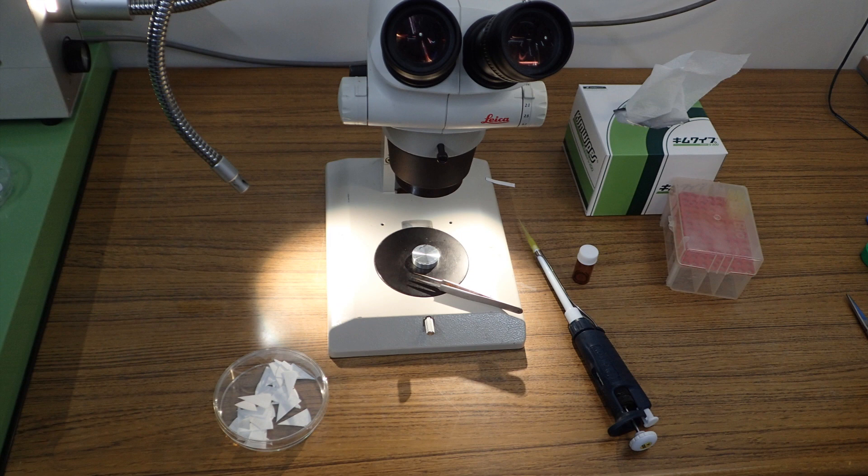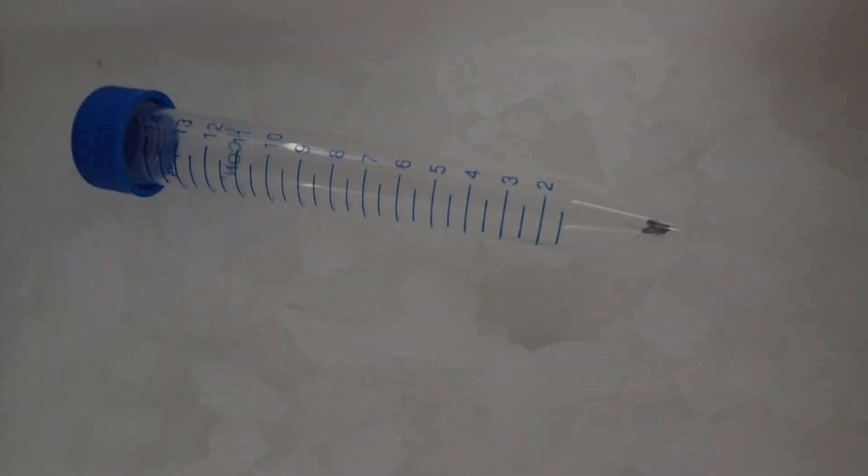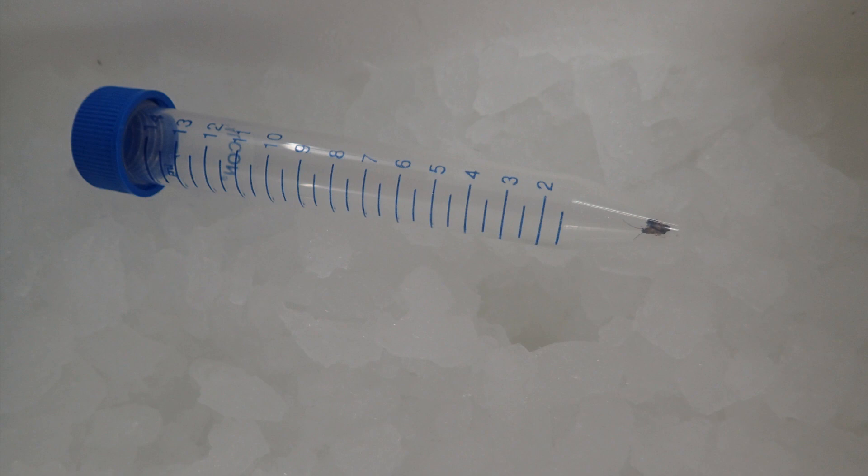Place the thawed nanosuit solution in a place where it is easy to work. For living insects, put them in a vial and anesthetize on ice.